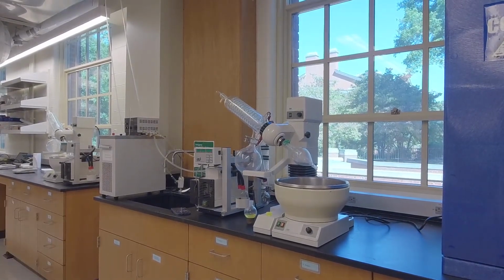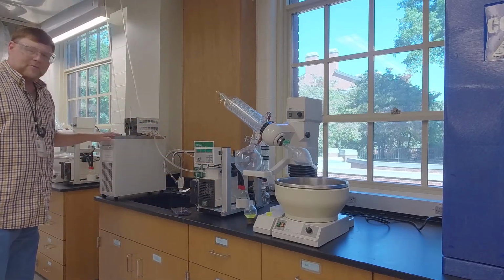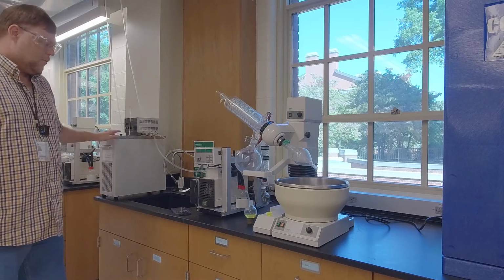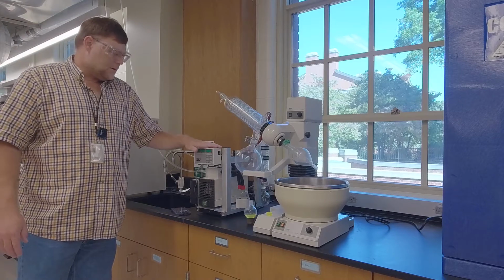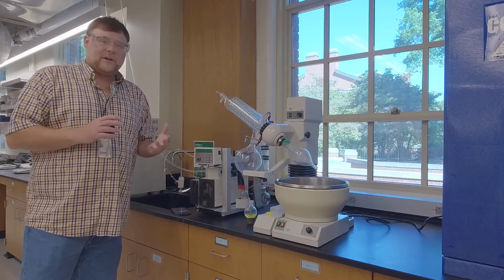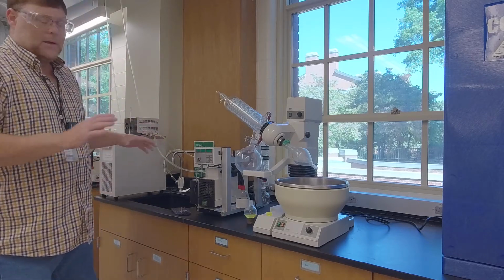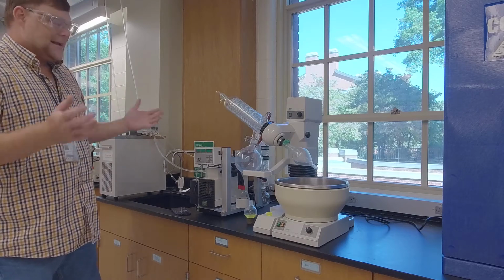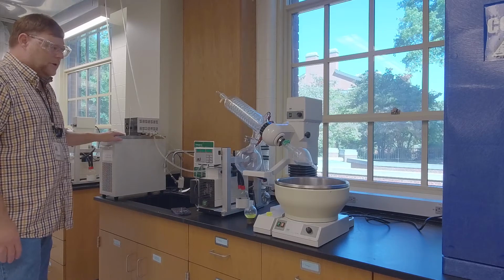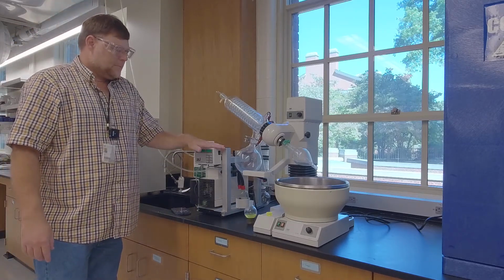All right, so here's the rotovap. This thing that I've got running over here is a chiller. I'll explain what that is in a minute. This is the machine that's going to generate a vacuum for us. So again, I talk in these videos about generalities and specifics. This is our specific rotovap. If you stay in chemistry, you'll experience lots of different kinds of rotovaps. So something that runs cold liquid through a condenser, something that generates a vacuum.